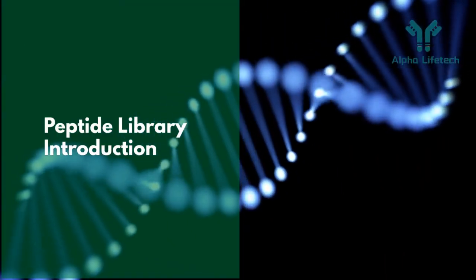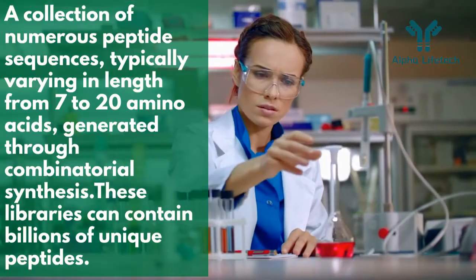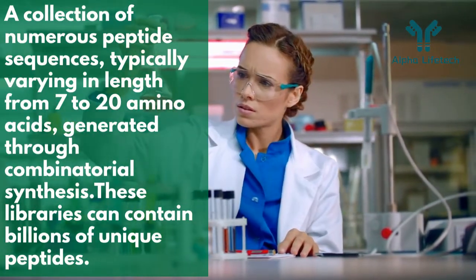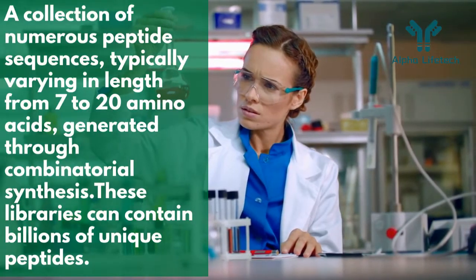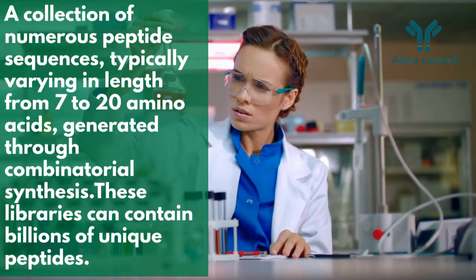Peptide Library Introduction. A collection of numerous peptide sequences, typically varying in length from 7 to 20 amino acids, generated through combinatorial synthesis. These libraries can contain billions of unique peptides.